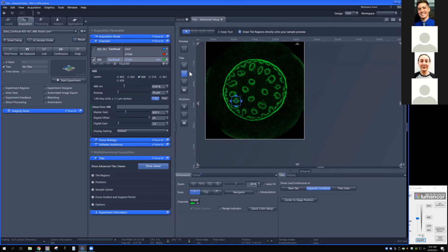And when we're working with this tool, basically what we can do is we can draw anything we want. So it's not just a set size. I can basically just left click and drag and let go, and it's going to create that rectangle that I want. Likewise with an ellipse as well. So whatever region I want to drag to create, I can do.